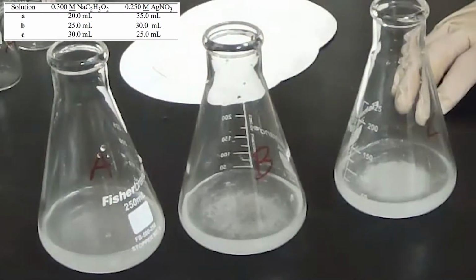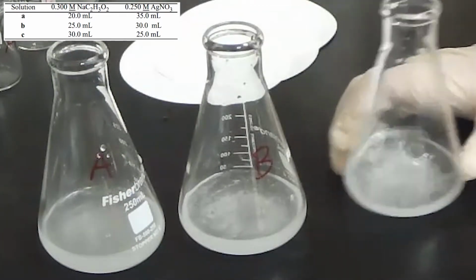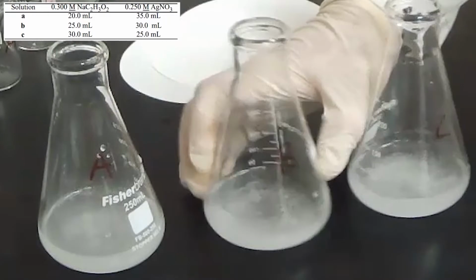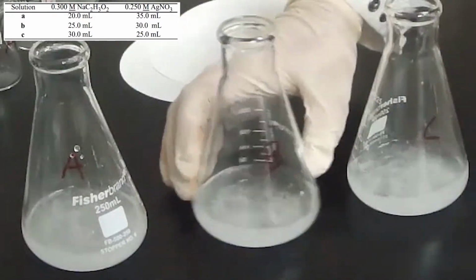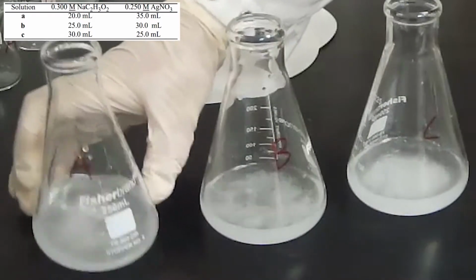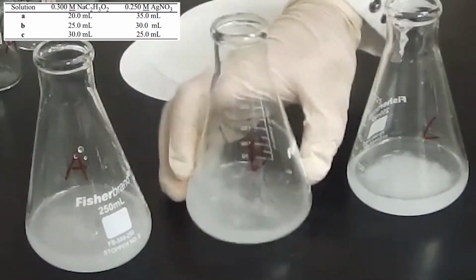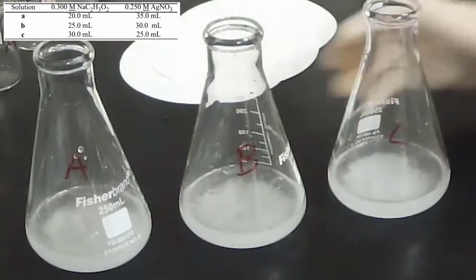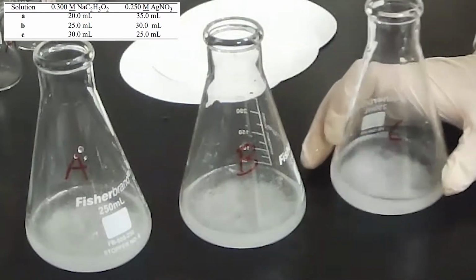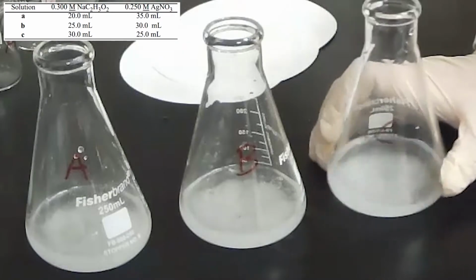And then just intermittently, just to make sure we're still colliding our reactants with one another so that the reaction can continue. These will not need to be swirled as often as our filtration.